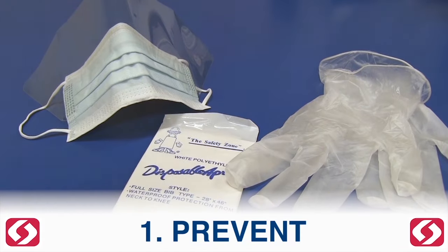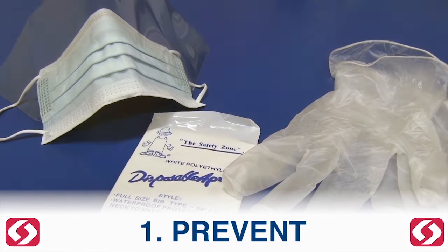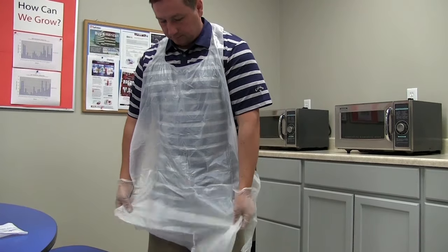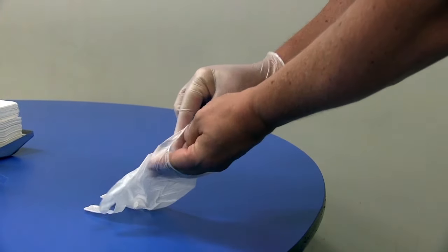Prevent. To prevent direct contact with the spill during the cleanup process and minimize the risk for infection, disposable protective clothing must be worn. This includes gloves, combo mask safety shield, and protective apron.